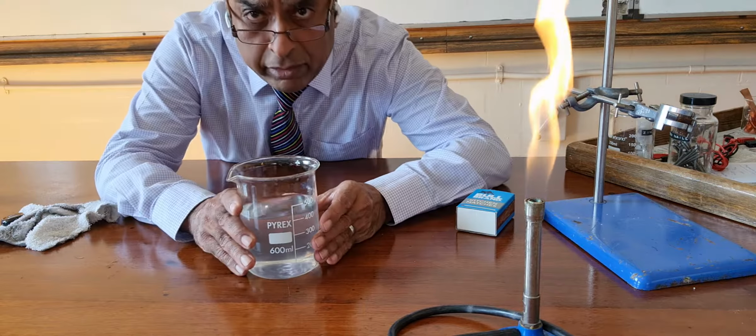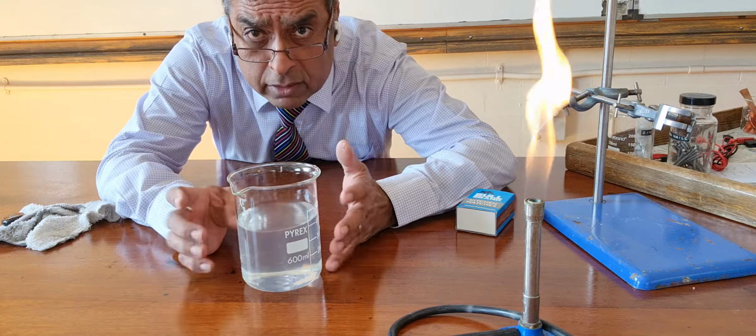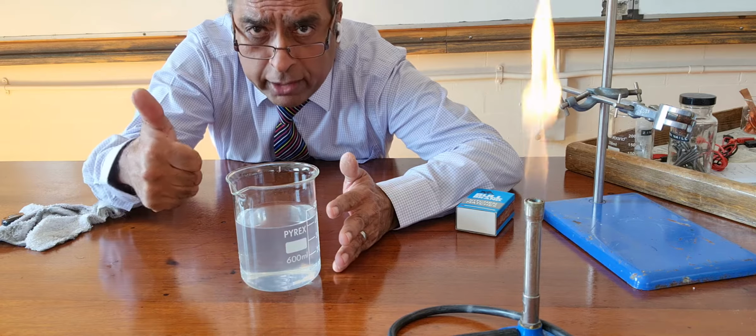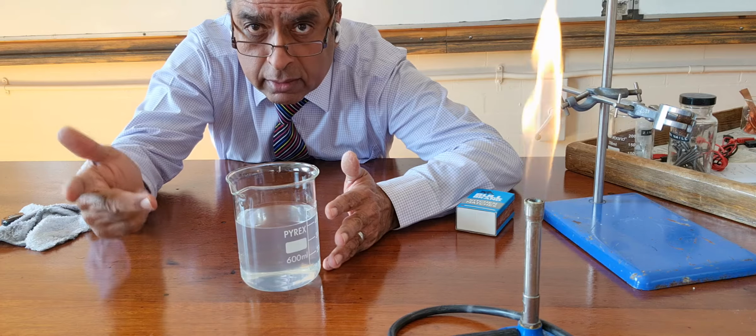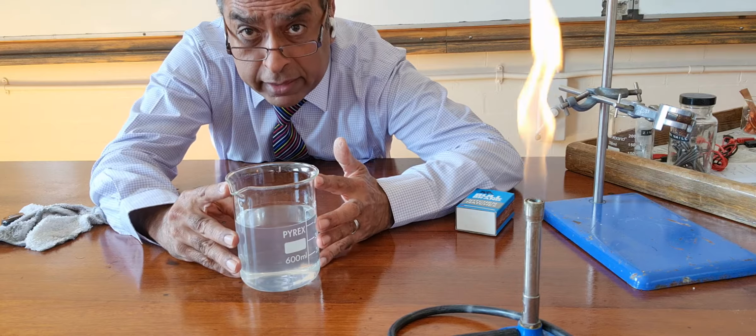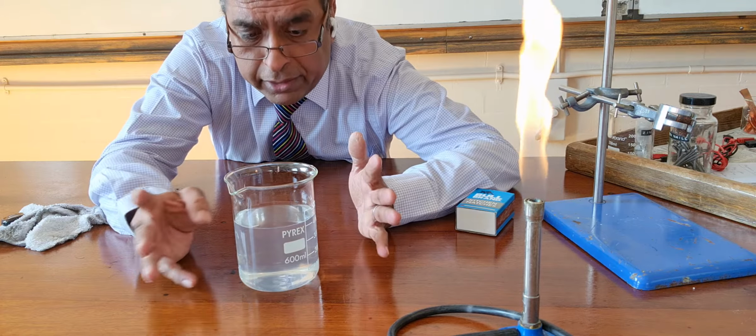So carrying on with that theme, I want to try and react water with a famous metal called magnesium. Remember magnesium? You may have come across it in general science. It's the metal that burns with a bright white light, and it's so bright that you can't look at it directly. You have to look away or look at it through blue glass, etc., to reduce the amount of light that goes in your delicate eyes.